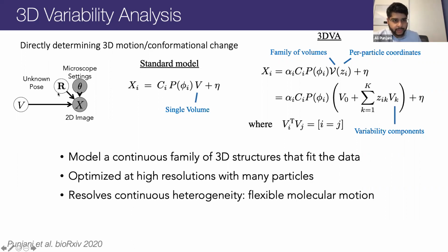So like I said, we're going to start with a consensus refinement and take the poses from that refinement and fix those. And finally, there's the 3D structure itself, which previously in the models that we've considered is represented by one or more discrete static 3D electron density maps. So V is literally, in the homogeneous refinement case, a single electron density map, or in heterogeneous refinement or ab initio reconstruction, it's one of K discrete, maybe that's 3 or 5, whatever the number of classes was, discrete different 3D electron density maps, and they're not related to each other in any way.